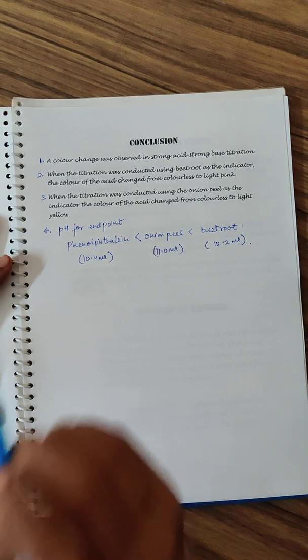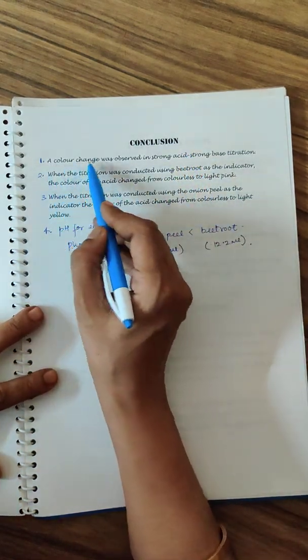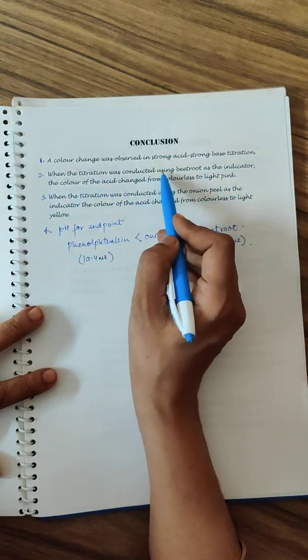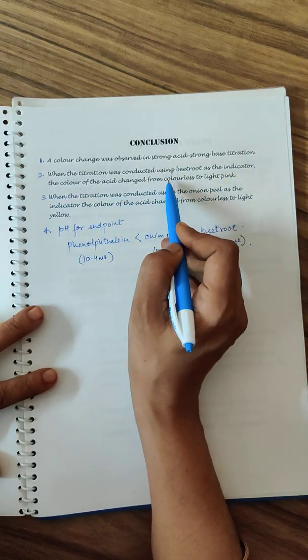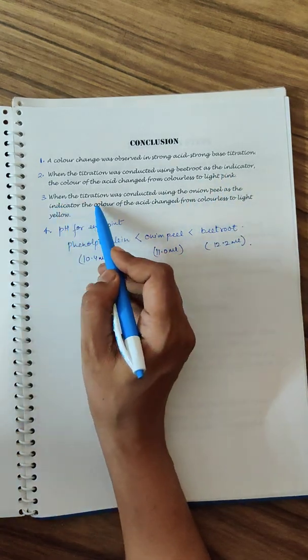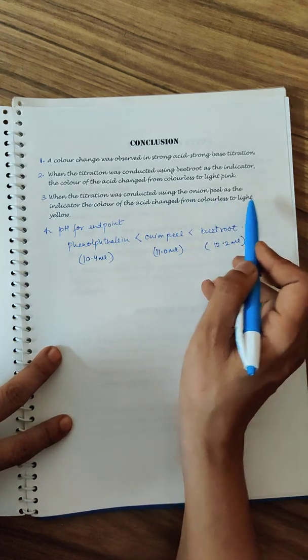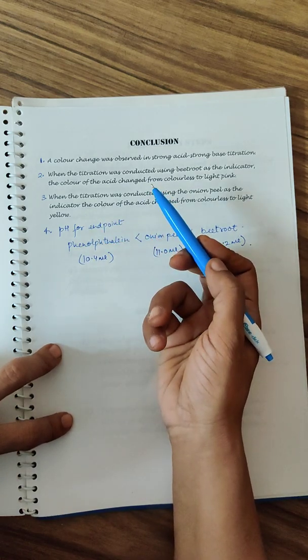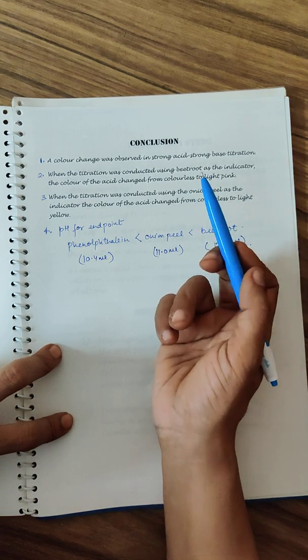Now coming to the most important part - the conclusion of the project. The color change was observed in strong acid and strong base titration. When the titration was conducted with beetroot indicator, the color of the acid changes from colorless to lightest possible pink as done for phenolphthalein. When titration was done using onion peel indicator, the color of the acid changes from colorless to light yellow. It could be different for rose, petunia, or marigold.